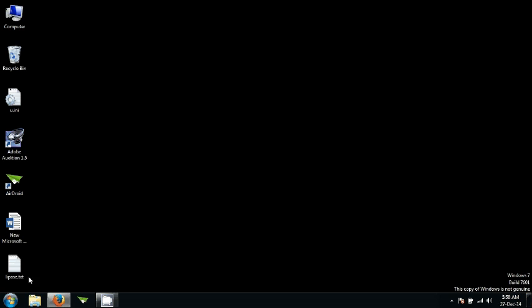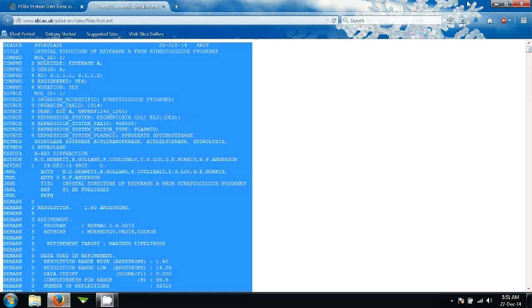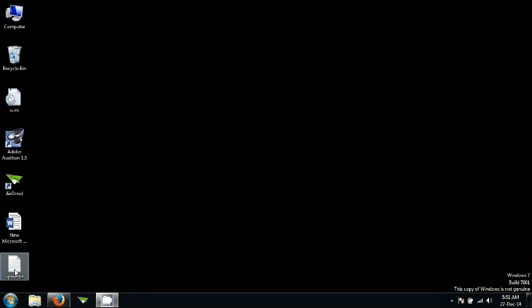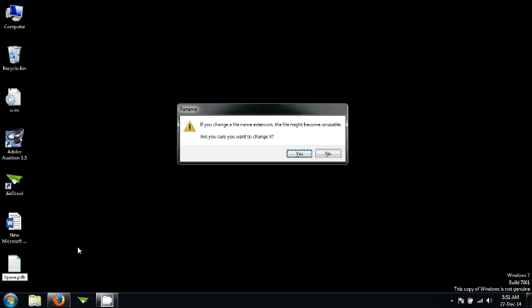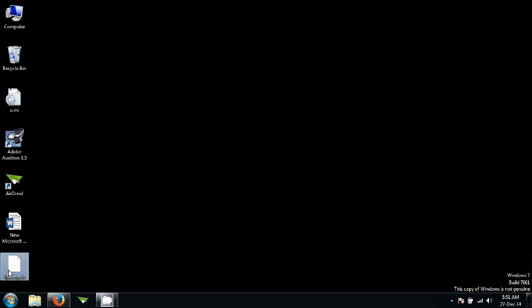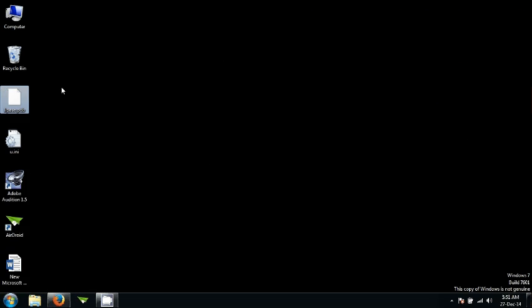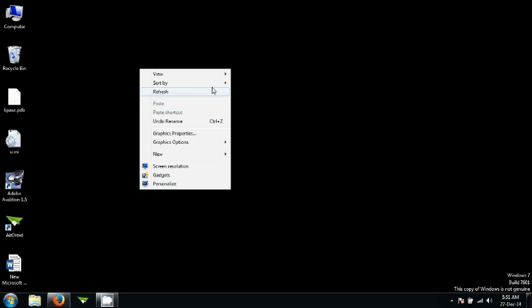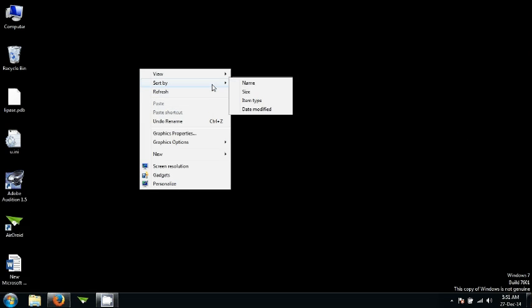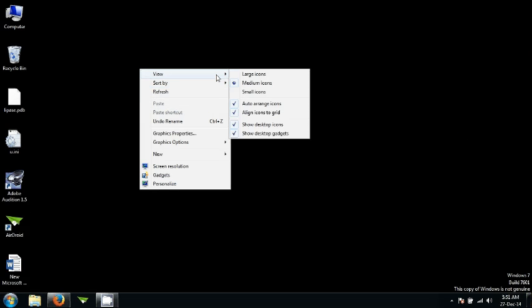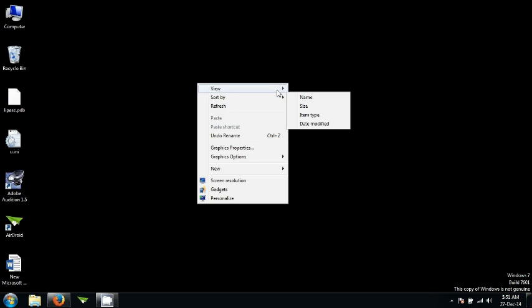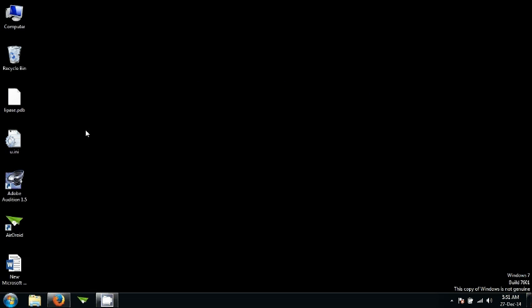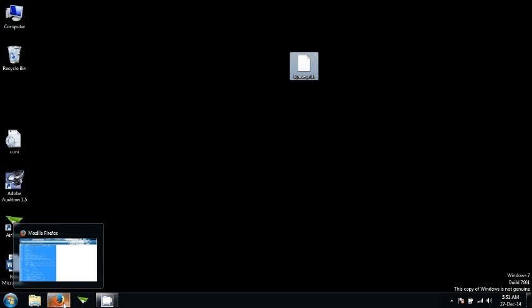Another thing that I forgot to mention is that you need to change the extension of this from text to PDB. In order to do that, press F2 and then change this TXT to PDB.